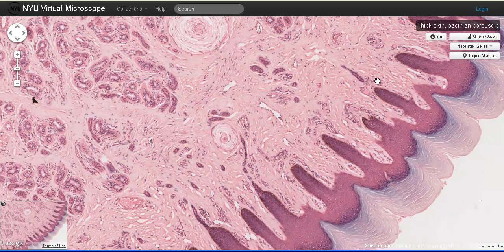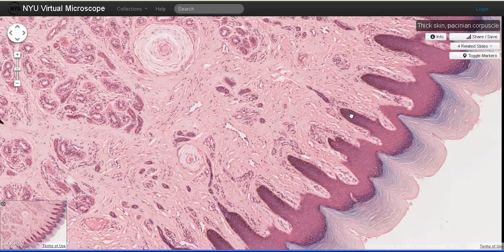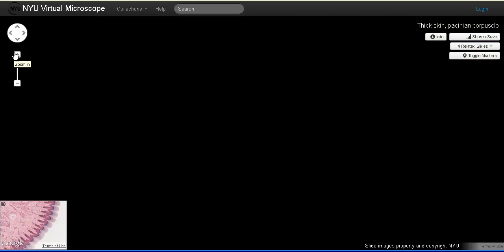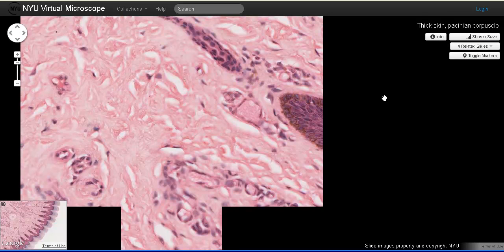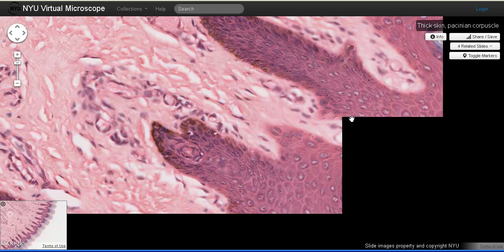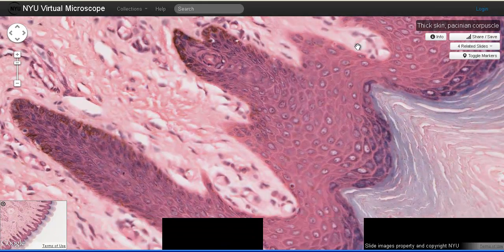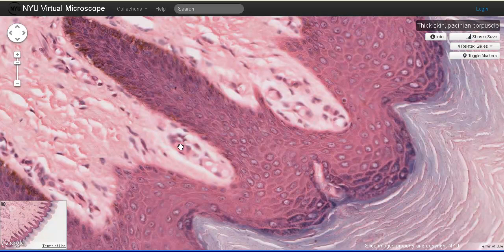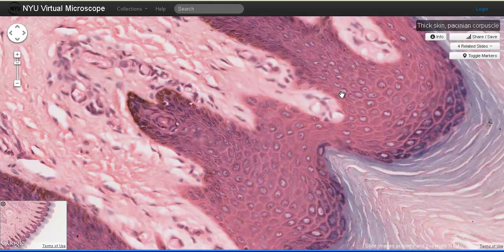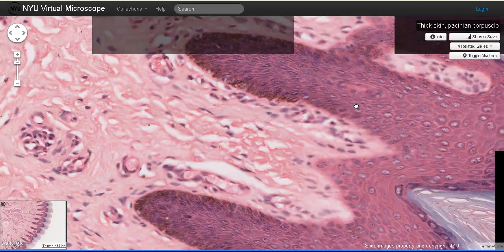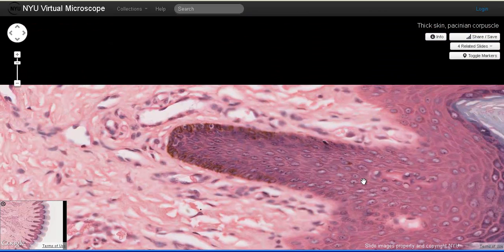We also find projections of the dermis into the epidermis — these little protrusions are referred to as dermal papillae. If we look in the dermal papillae, we will find some specialized sensory structures known as Meissner's corpuscles. Meissner's corpuscles are touch receptors that help to detect light touch. Here's one here, and there's part of one there. They are found in these dermal ridges.